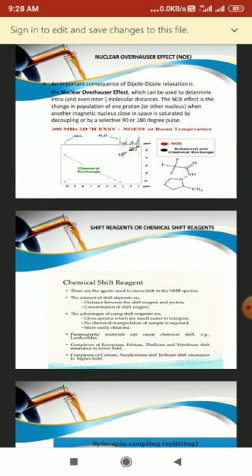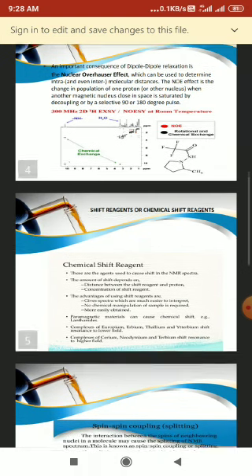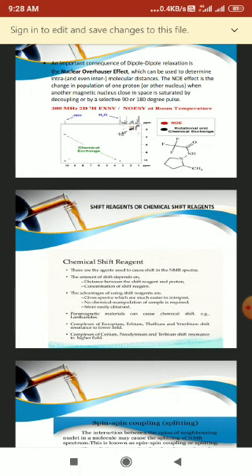As a result, the NMR spectrum of a compound that contains a group possessing an unshared pair of electrons undergoes change, and a large chemical shift, a difference in peaks, is observed. All the shift reagents are mild Lewis acids. Shift reagents separate NMR signals that normally overlap. Thus, it gives a more simplified spectrum.